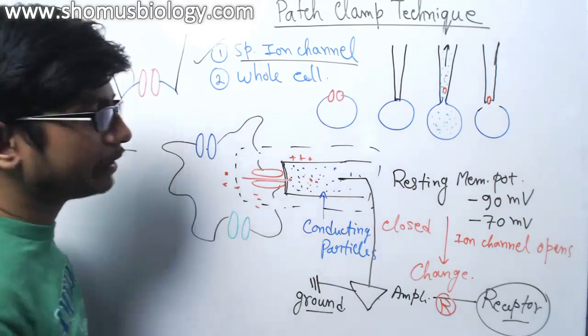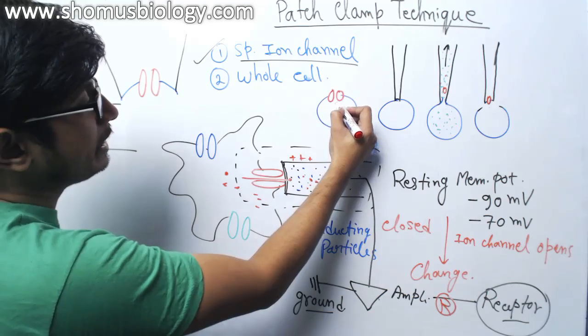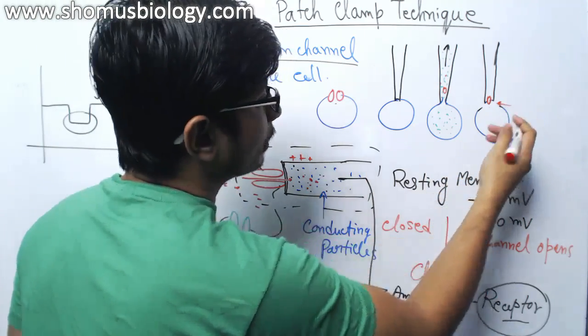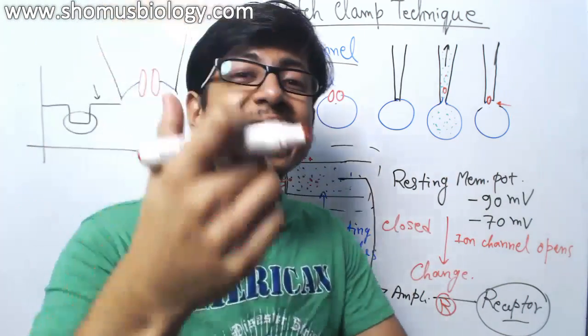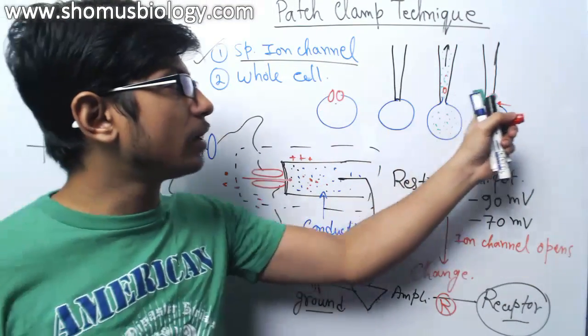Normally an ion channel is embedded in the membrane. So you see, it's completely cleaved out. Whatever was inside now gets outside, because it's now outside in the air. The pipette is in the air, so the inside of the ion channel is now contacting air.